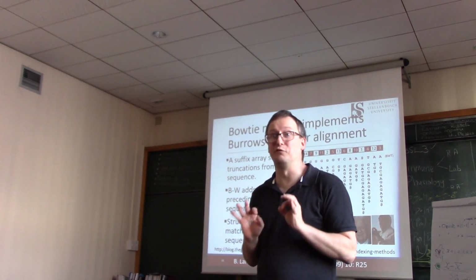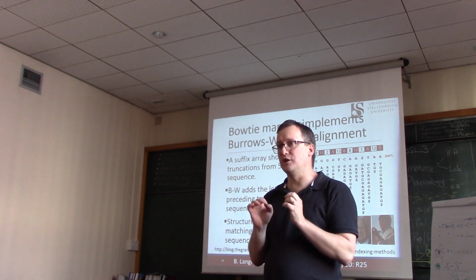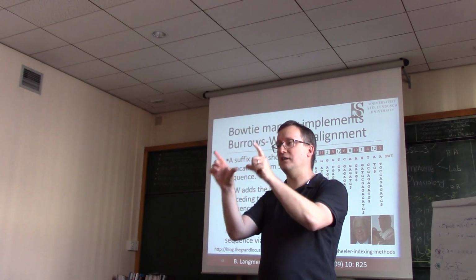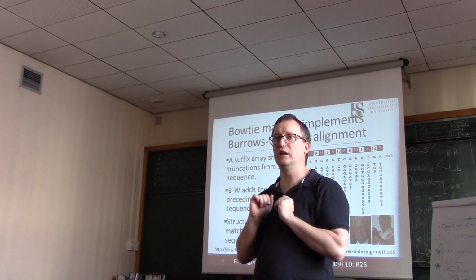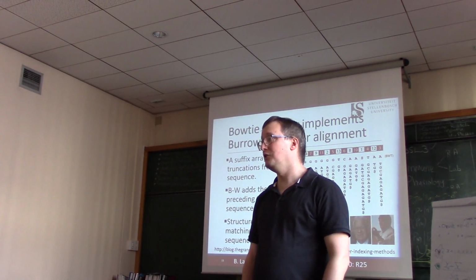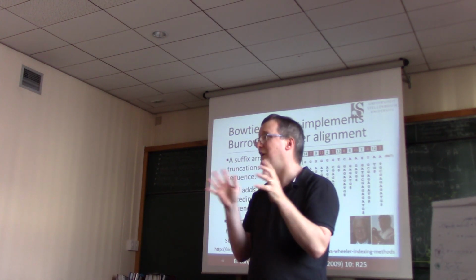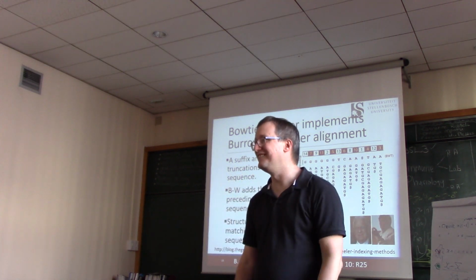There are lots of brute force and ignorance algorithms out there, so I'm going to walk you through one. Imagine that for every read produced in our experiment, we ask, is this exact sequence found anywhere in the genome annotation? So how would you do this on your computer? You'd probably open the genome annotation, type Control F to open the find box, type in your sequence read, and then see if you get a hit.